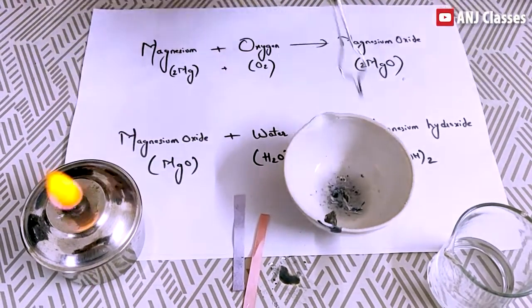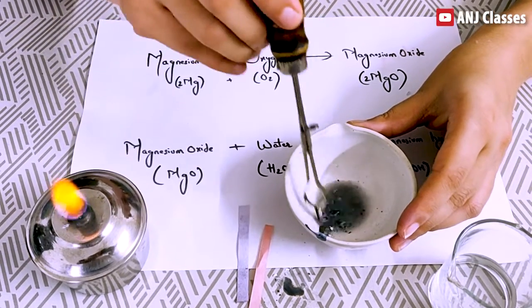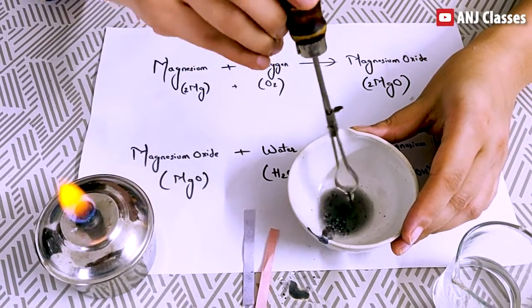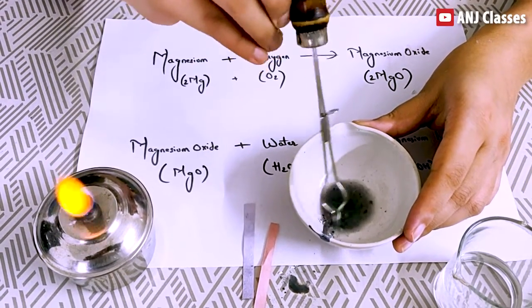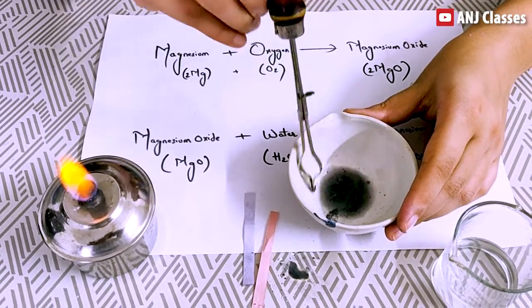You have seen as magnesium burns, metals combine to form magnesium oxide and I have added water to form magnesium hydroxide. Now we will test it with red and blue litmus paper.